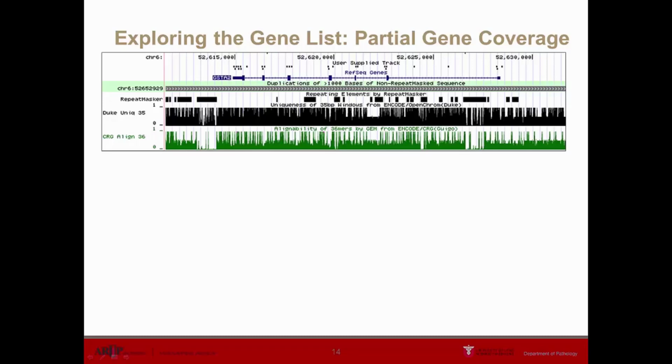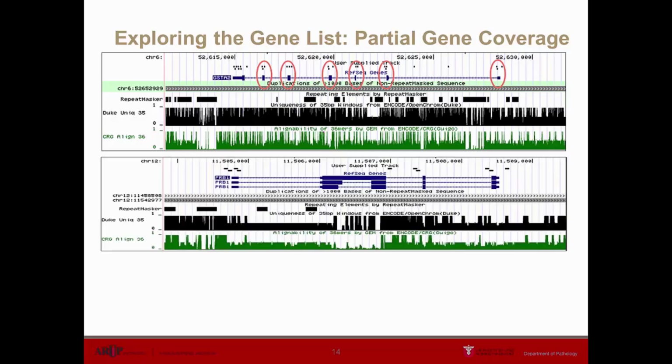Again, segmental duplications cause a problem with placing unique probes. In this example, with the GSTA2 gene, 6 of the 7 exons only have 3 probes. They were able to get some unique coverage, but not enough for our calls of 4 probes to detect a single exonic level change.